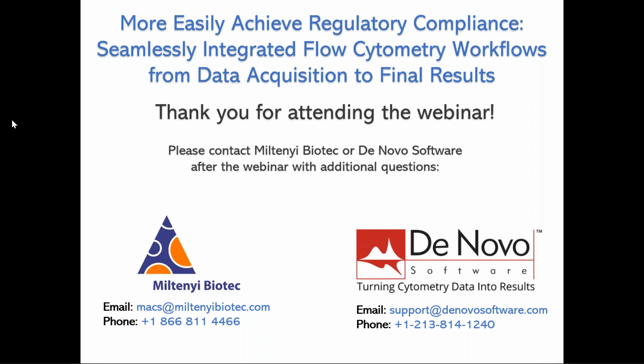But generally, I don't see most folks doing that. The reason they want to work with MQD files in FCS Express is so that they don't have to generate some sort of intermediary file type that also needs to be validated along the way against the MQD file. So there's a lot of flexibility to do these things, but you can just load those MQD files directly.